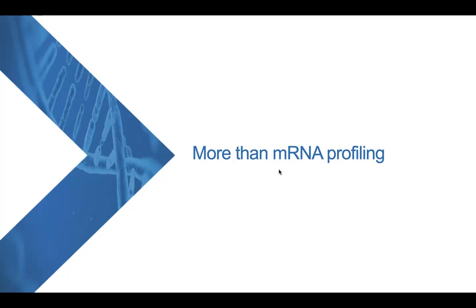Another question, has single cell RNA sequencing been used in plant science so far? Yes, we have used single cell RNA sequencing in plant science. We already have data from the Arabidopsis rosettes, as well as from the Arabidopsis root.